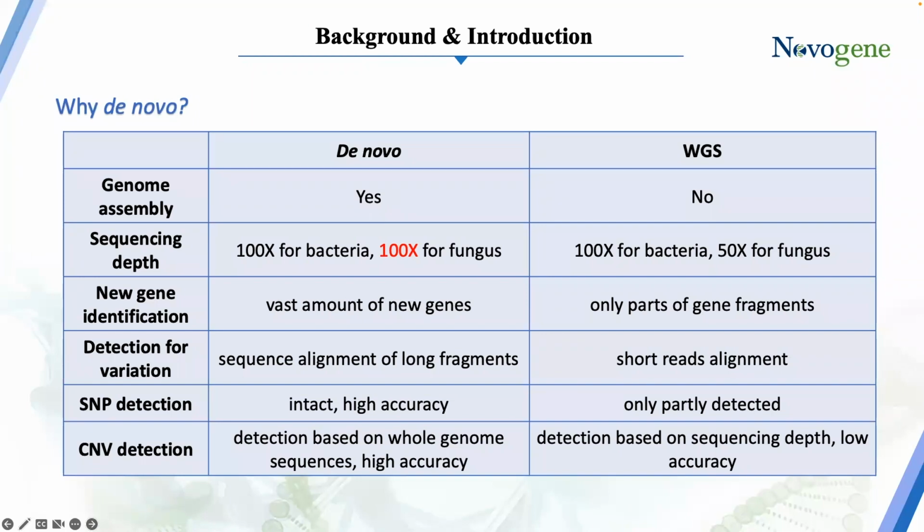This is where de novo sequencing comes in. For de novo, it might look a little bit different depending on the species, what you would do to actually build your reference genome. If it's de novo, you pretty much have to build a reference genome to have something usable. And so for bacteria, Illumina sequencing can work. Fungus, it doesn't work as well, that short read sequencing, because it's a more complex genome generally, high heterozygosity rates. And so the need here changes for de novo sequencing.